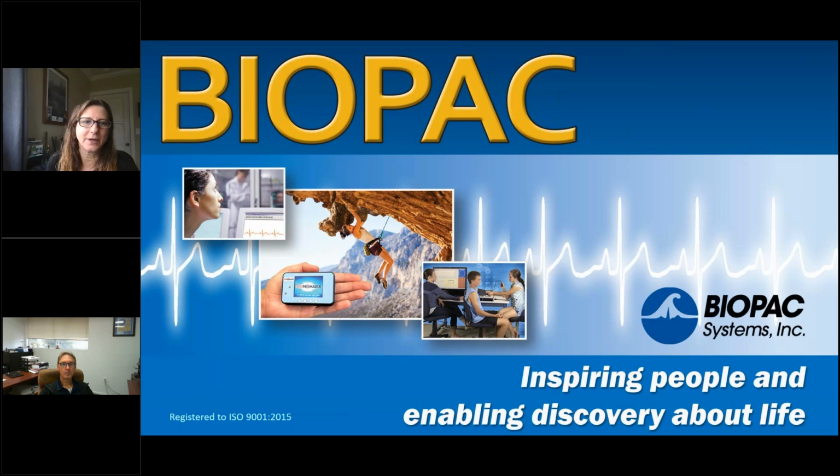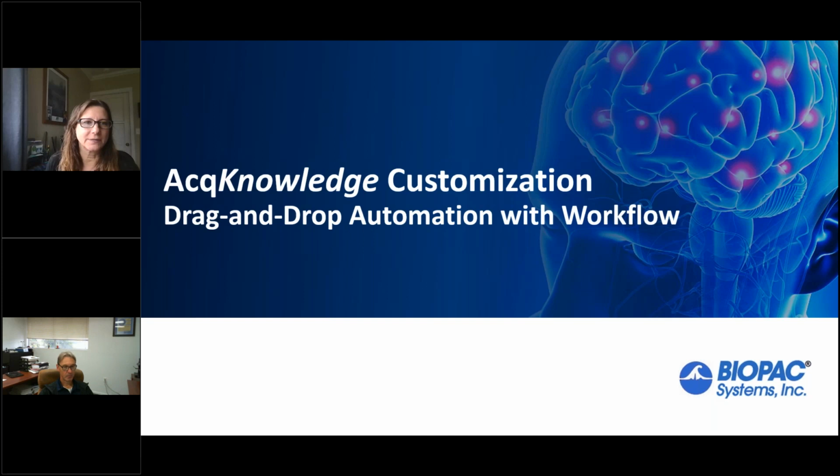I'm Brenda Dettinger from BioPack, and I'll be your moderator on today's webinar, AcqKnowledge Customization, Drag and Drop Automation with Workflow. This is a really cool feature, and if you don't know about it, you're gonna love learning about it today. And if you do know about it, you're gonna learn how to set it up today. We do have a very full presentation.